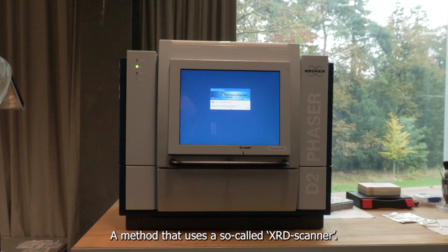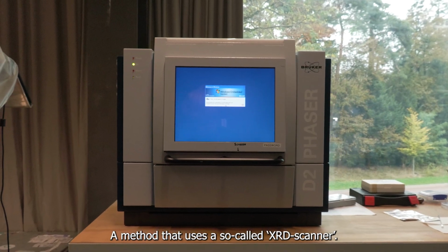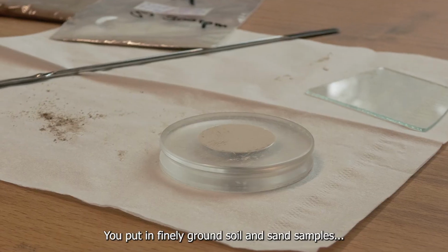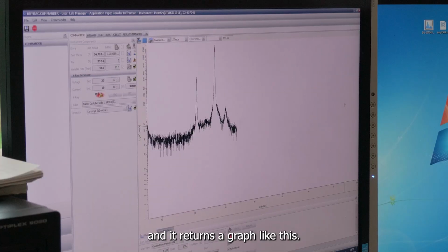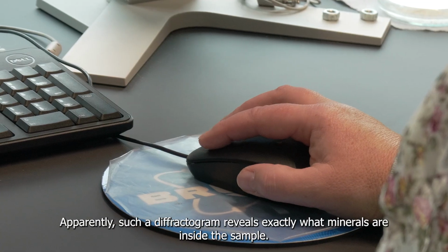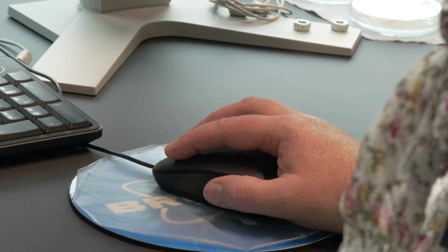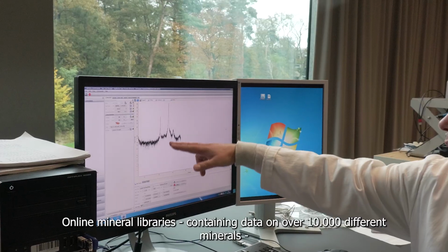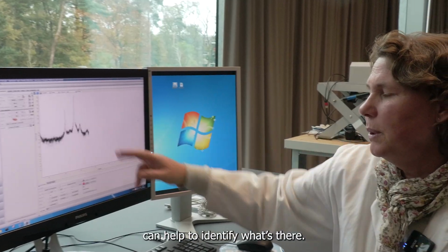X-ray diffraction. A method that uses a so-called XRD scanner. You put in finely ground soil and sand samples, and it returns a graph like this. Apparently, such a diffractogram reveals exactly what minerals are inside the sample. Online mineral libraries, containing data on over 10,000 different minerals, can help to identify what's there.